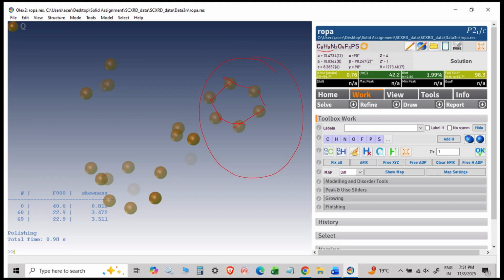As you can see in the formula, there is a phosphorus there, sulfur there. So if the highest electron density atom or spherical moiety would have been sulfur, I would have assigned it, then refined it again, and I would have gotten the structure. I would have started from one singular atom or one particular ring. It doesn't matter because I've tried both ways.